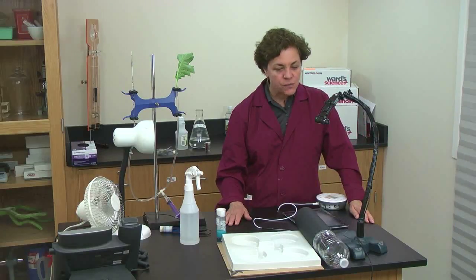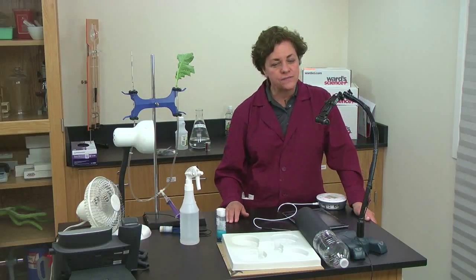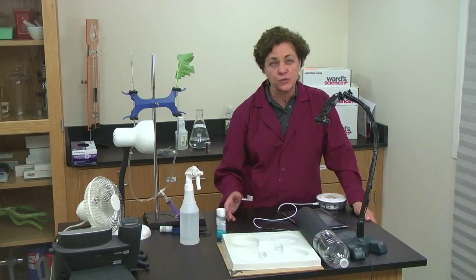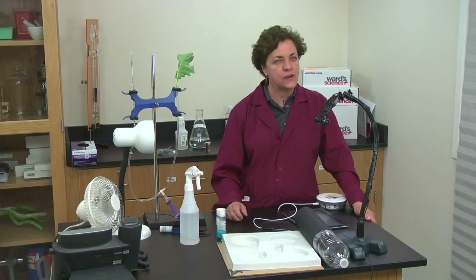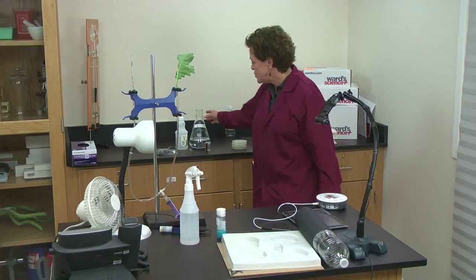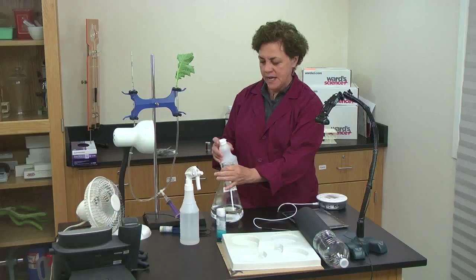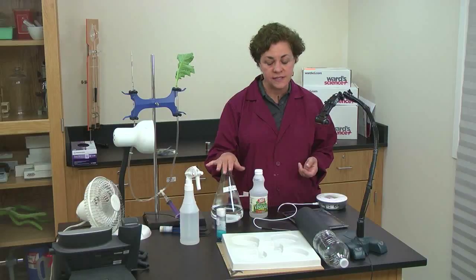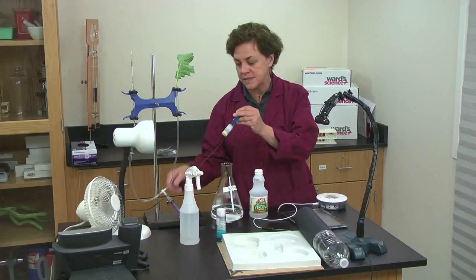And for pH, we always say that it is attracted by acid, or that's one of the things we test, and we always test vinegar. But vinegar is a very fragrant acid, so we might want to see if it's due to it being an acid, or is it due to it being that particular fragrance. So you can take a pH of about 2, and you can take some vinegar. And if you want to prove or have the students do this, they can take the pH using the pH probe. That's where pH comes in for this one.